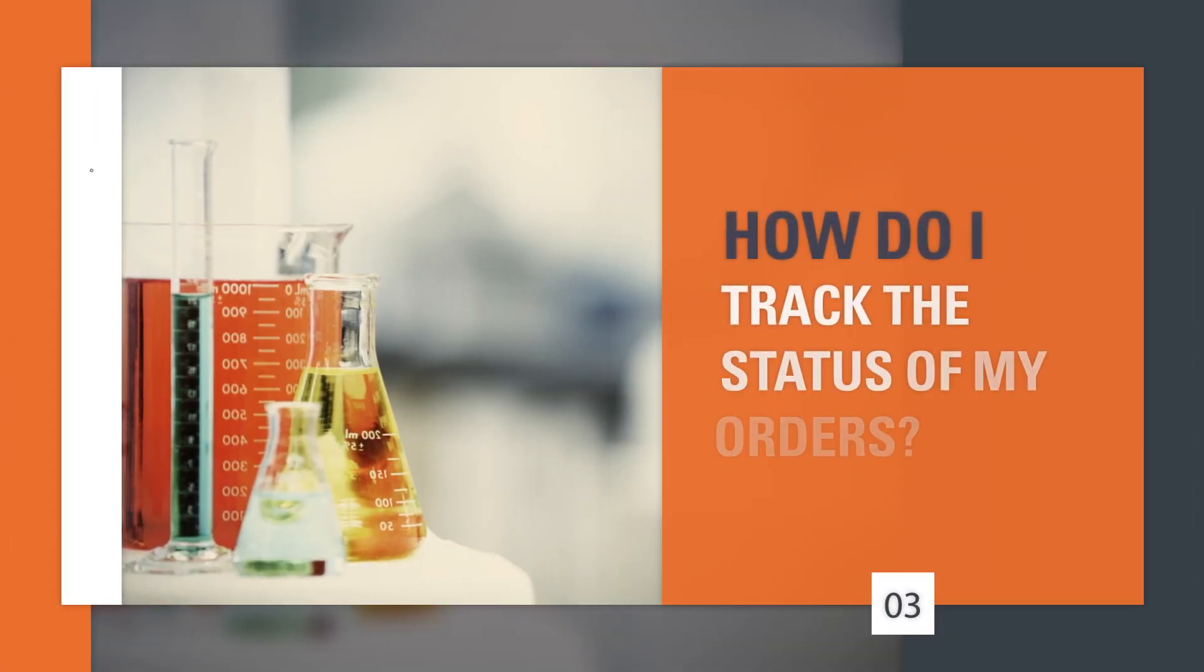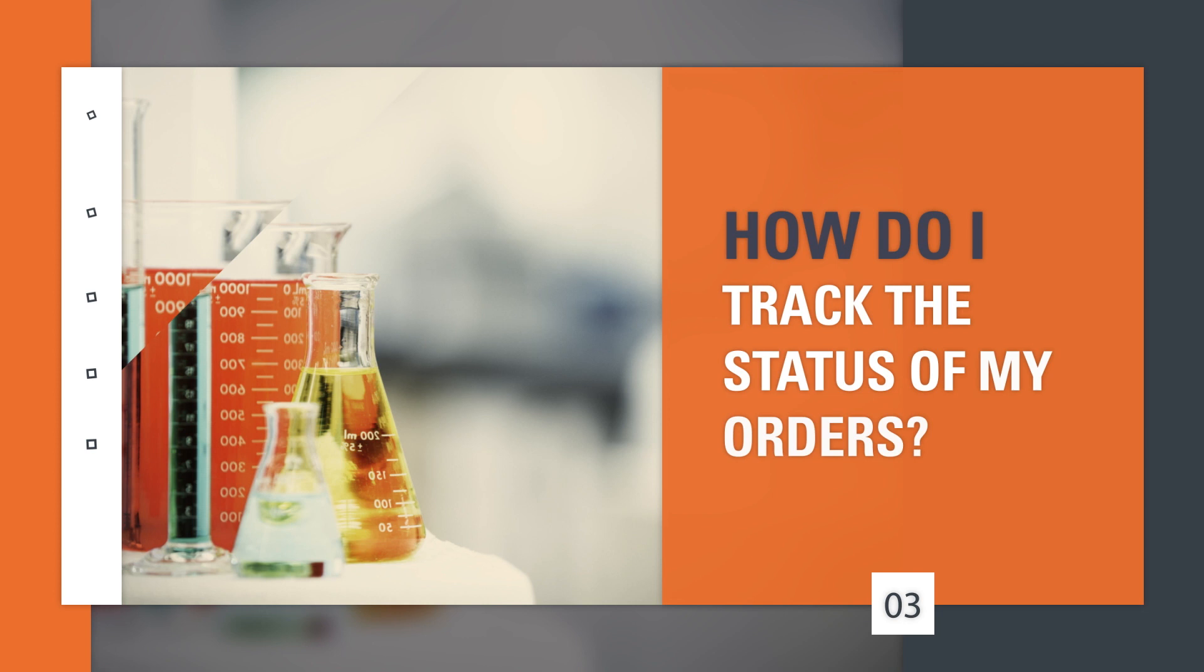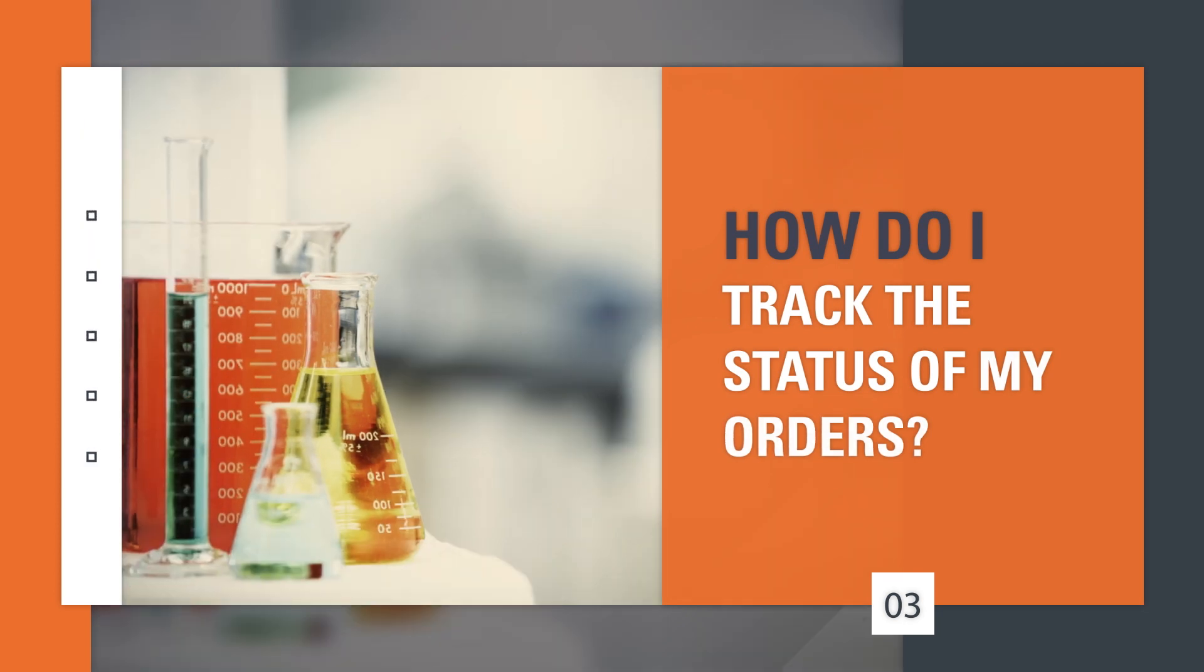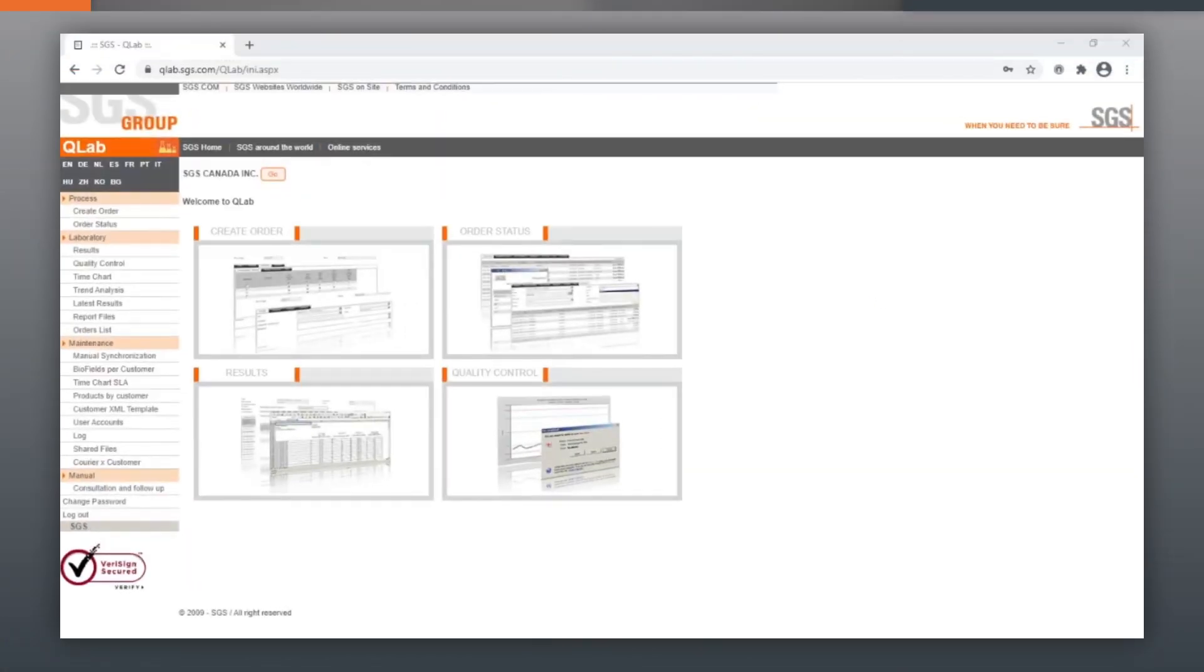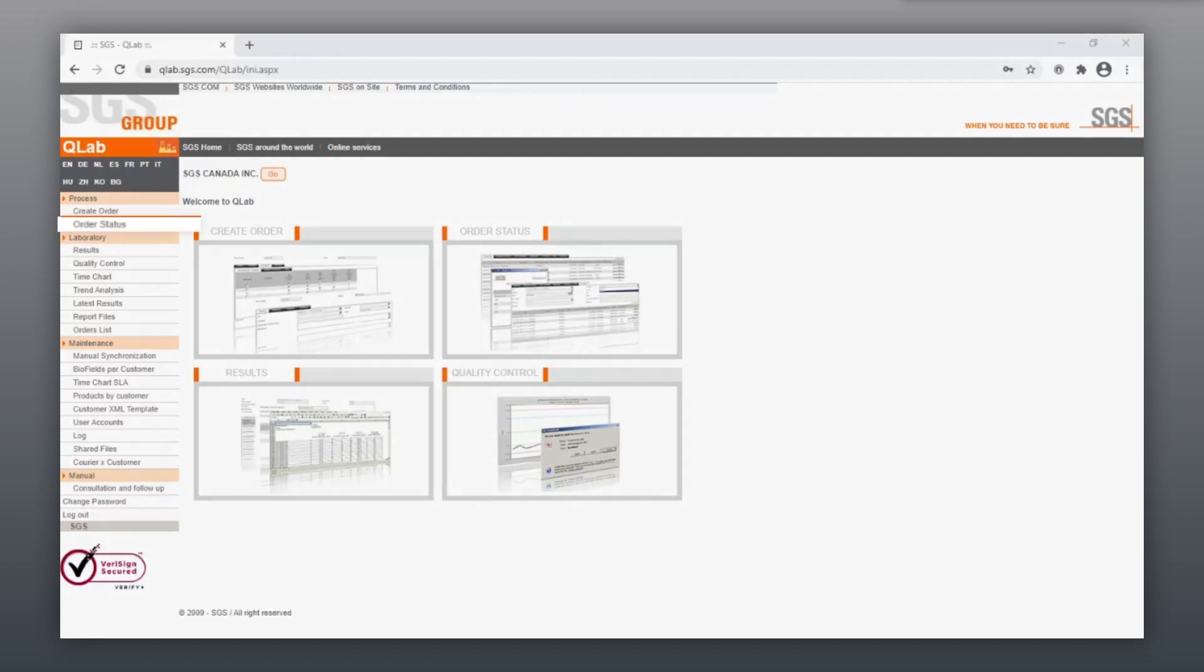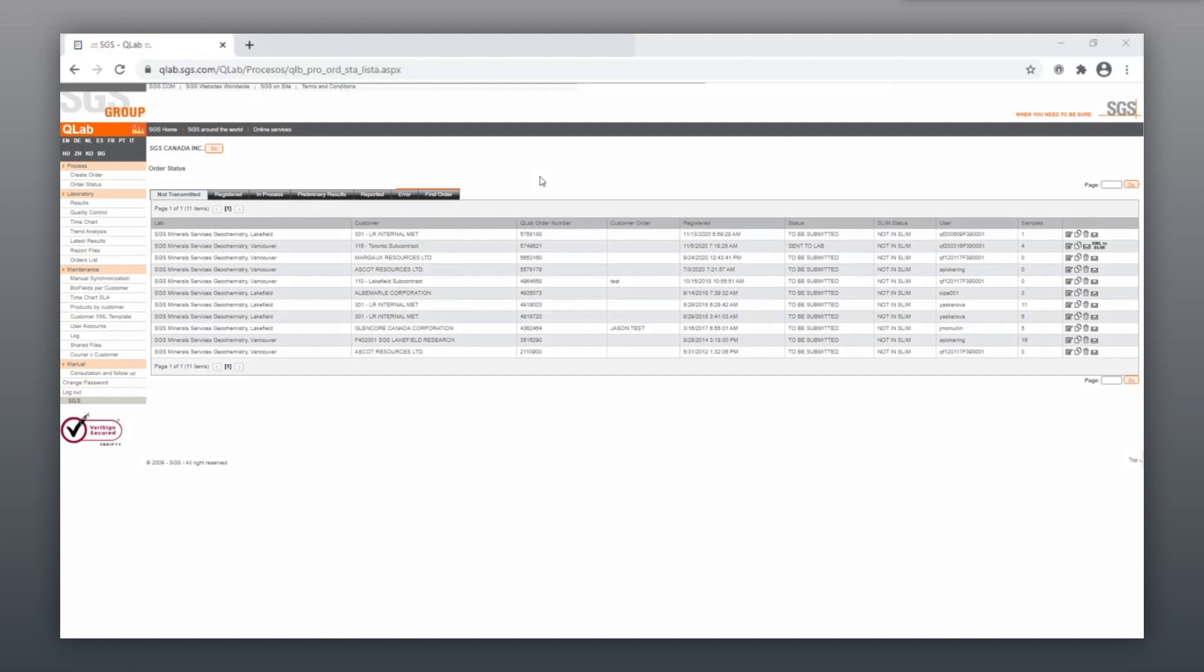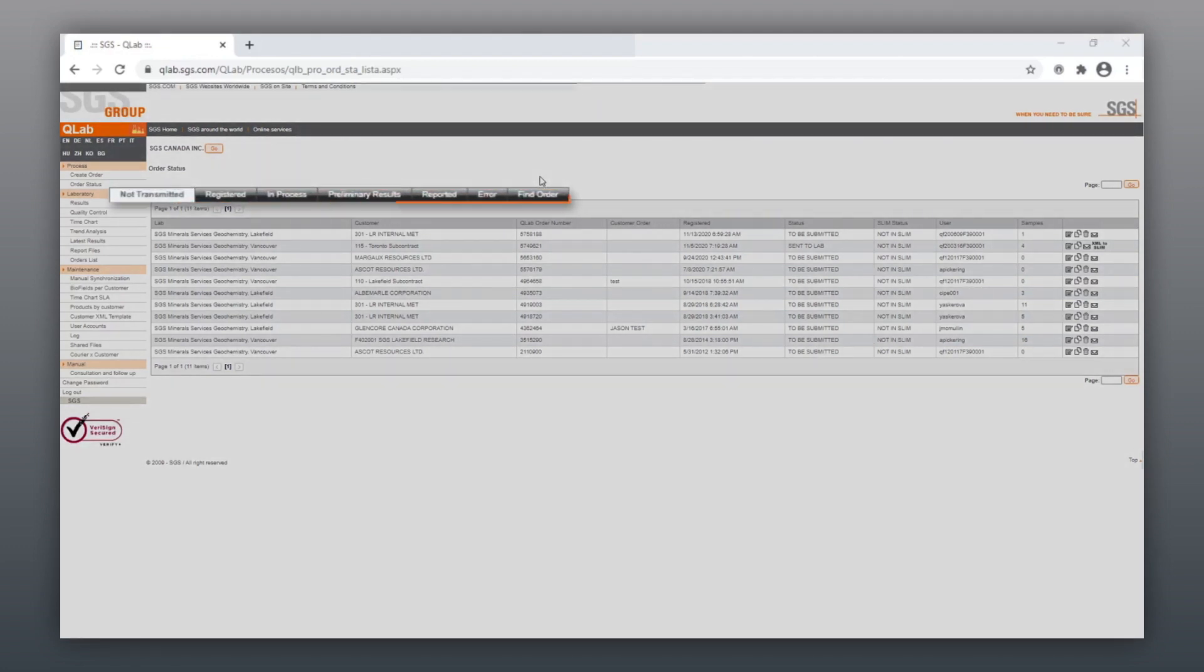How do I track the status of my orders? Order tracking starts by showing all your orders grouped according to their status. First, enter Status of Order menu. Click on the status you want to see.